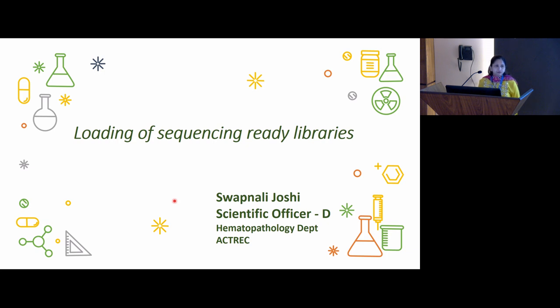TapeStation is expensive, it costs 30-35 lakhs, and unfortunately it is a complete monopoly of one company. So if you don't want to do that, Caliper LabChip is there, but that is not really for libraries. It's not that sensitive. You can just do a PAGE gel. If you are comfortable doing PAGE gels, you can get away with it just fine. You will get very good results.